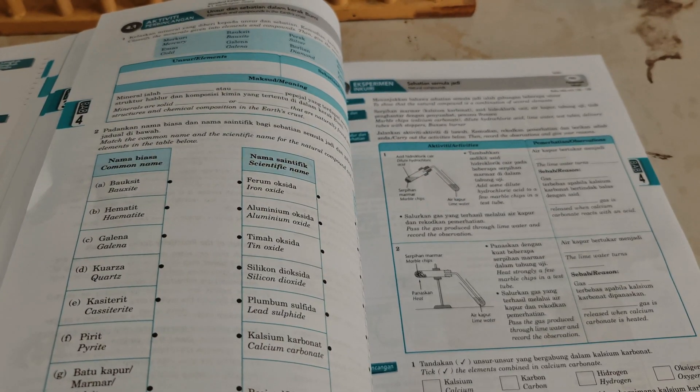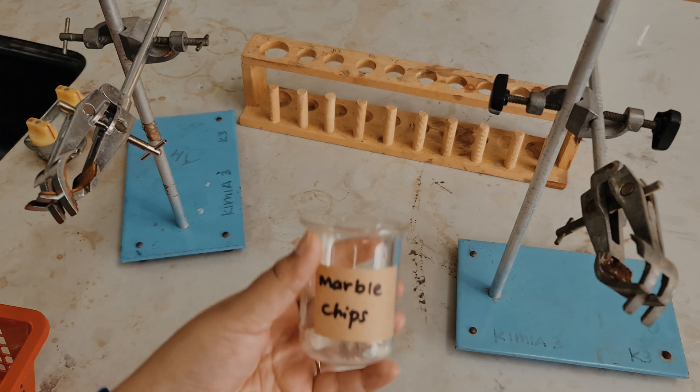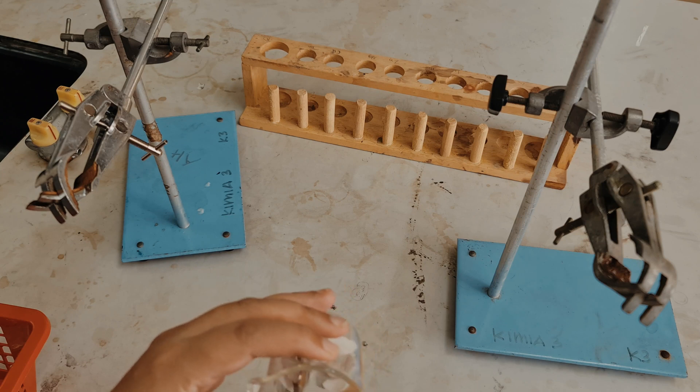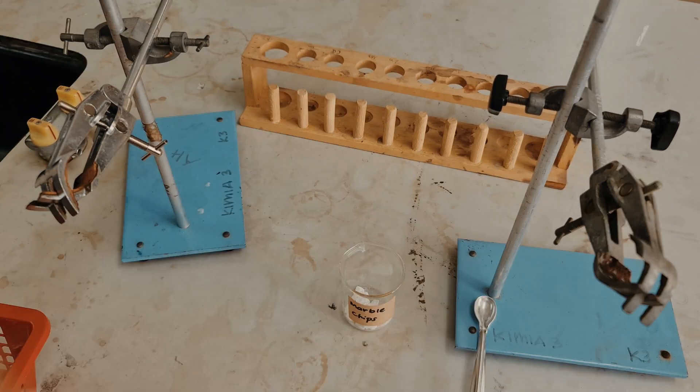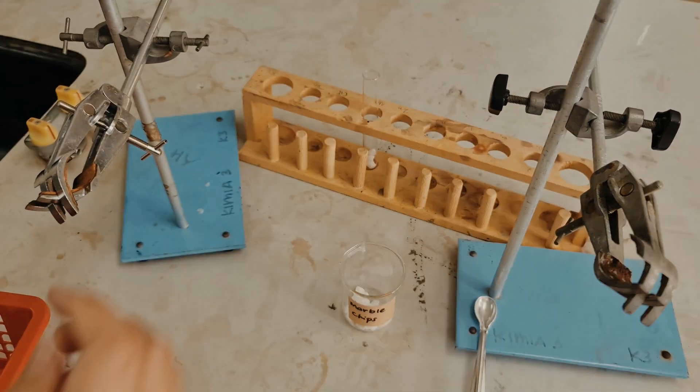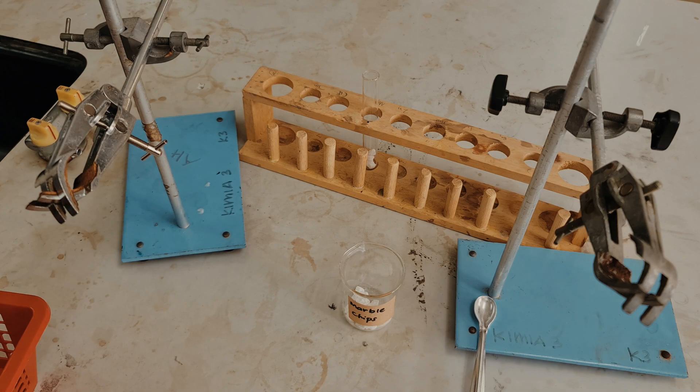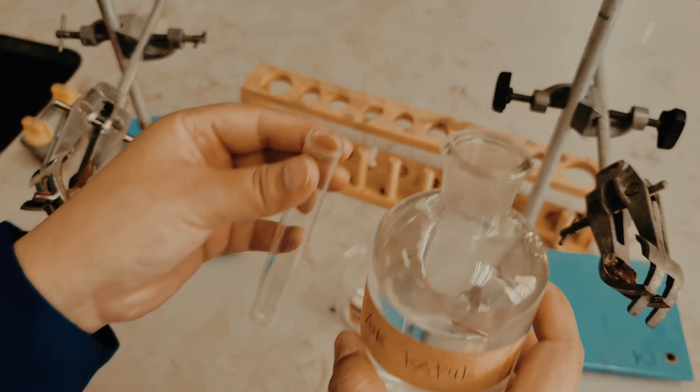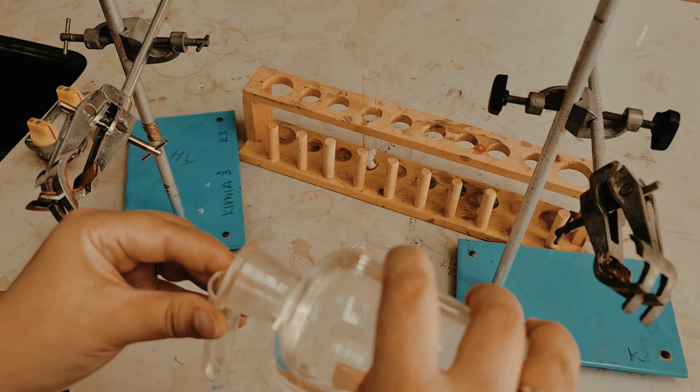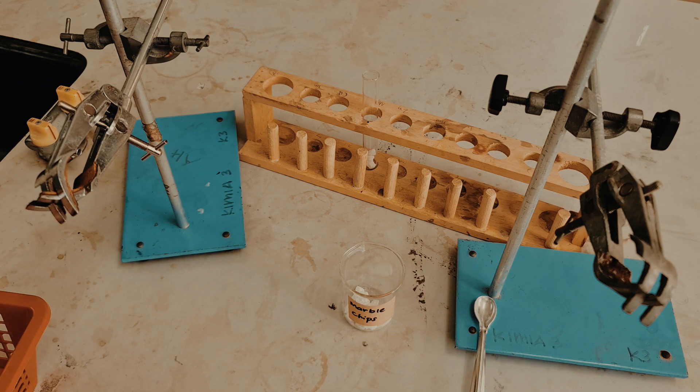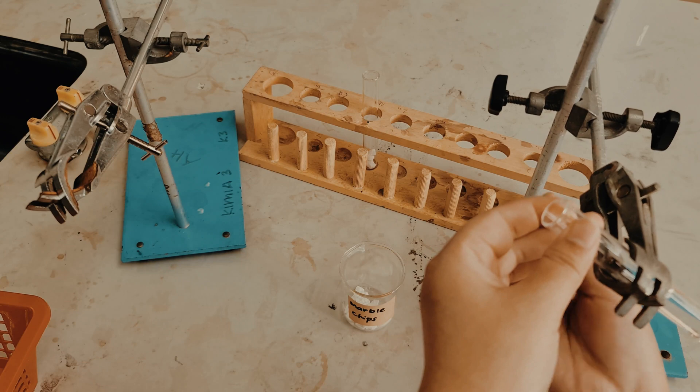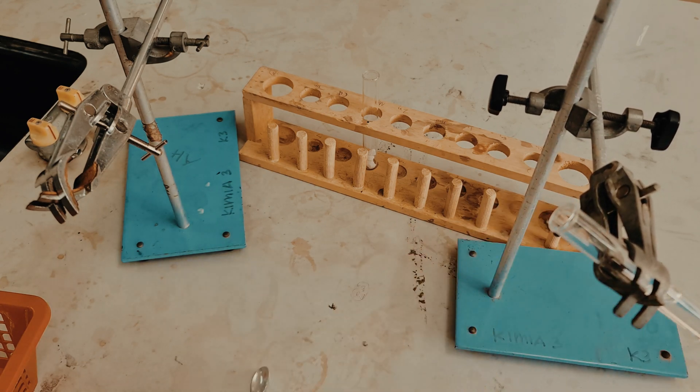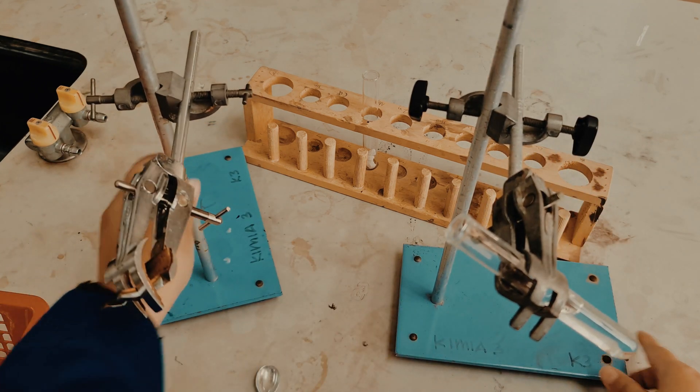Alright, now let's set up the apparatus. First, I'm going to add some marble chips into the test tube. I'm going to add some limewater into another test tube and we put it on the retort stand.